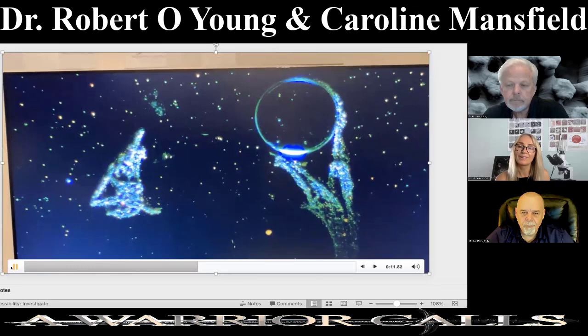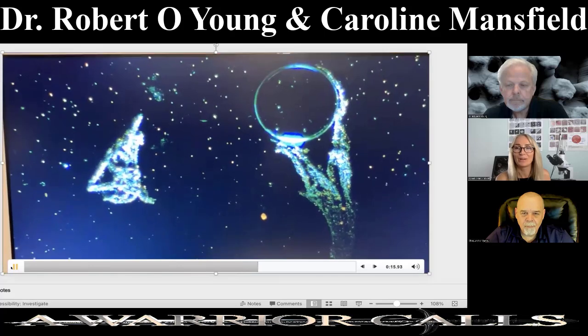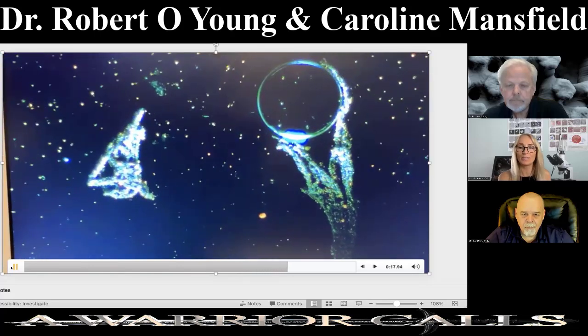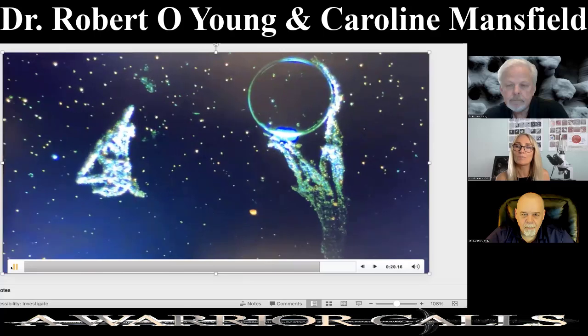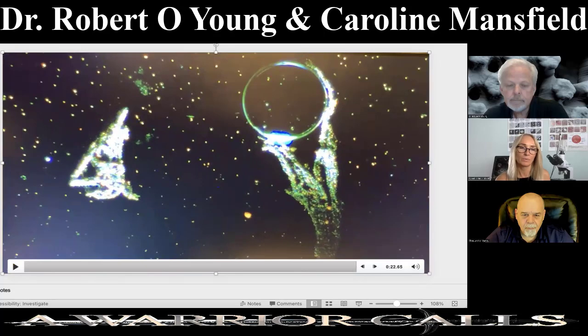And I'm moving the magnet above the slide, and I'm moving this hand, which is capturing an air bubble. I don't know why it's capturing this air bubble, but it's quite unusual. But, you know, these were highly magnetized particles inside the capsule of the vitamin D supplement. The product range came out of Australia.